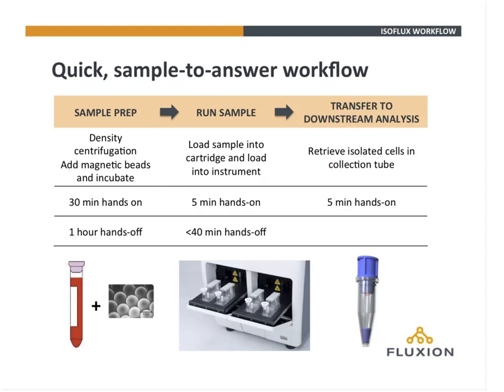So with that background in mind, I'm going to shift back to the IsoFlux workflow. There's 3 main parts to the IsoFlux process. There's sample prep, running of the sample, and then transfer to the downstream analysis.